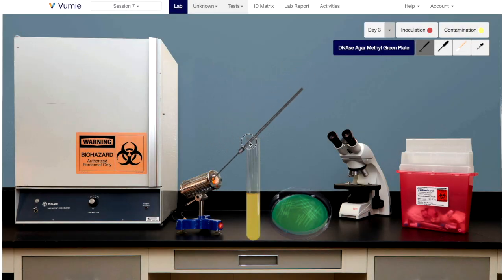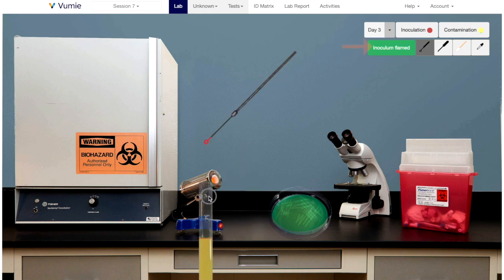Flame the transfer tool to prevent spread of the microbe. Flame the mouth of the inoculum tube. Look for the message indicating that this has been done.